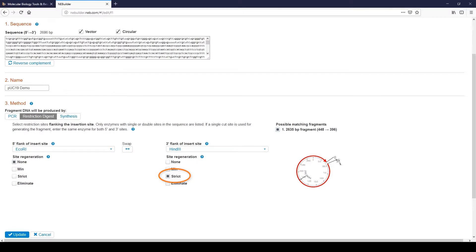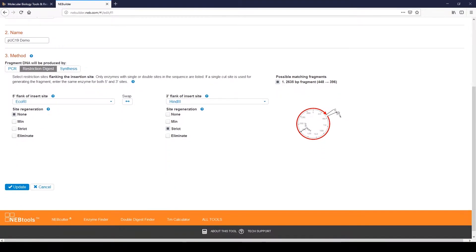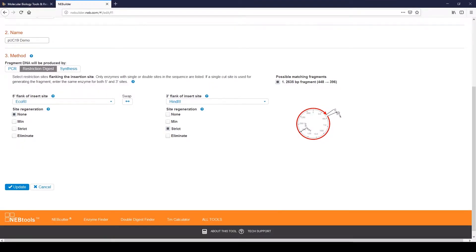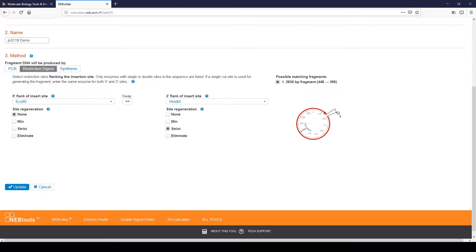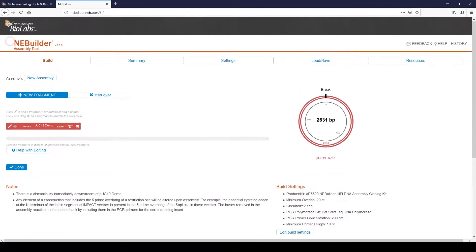Strict Regeneration adds all the bases required to regenerate the restriction enzyme site with no regard for the sequence of the adjacent fragment in the assembly. Minimum Regeneration takes into account the sequence of the adjacent fragment in the assembly and will use bases from that fragment, if appropriate, to regenerate the restriction site. Click Update to make the changes in the fragment.